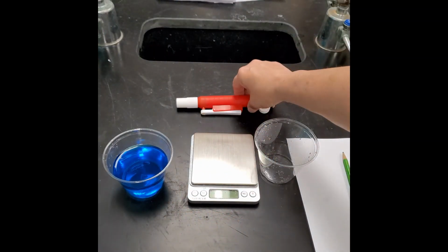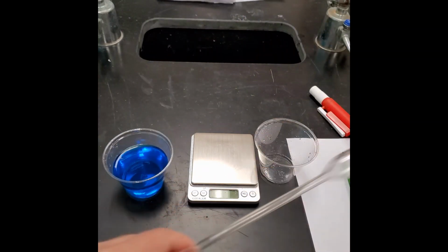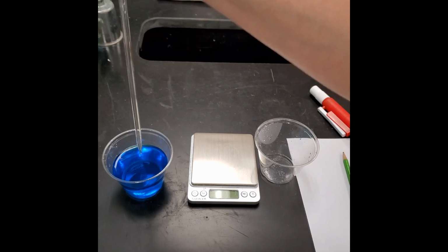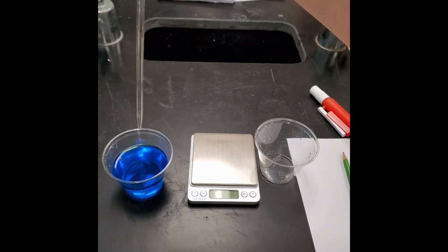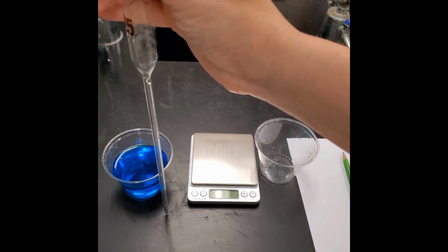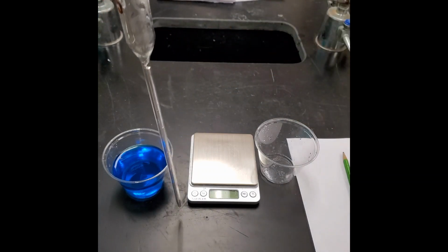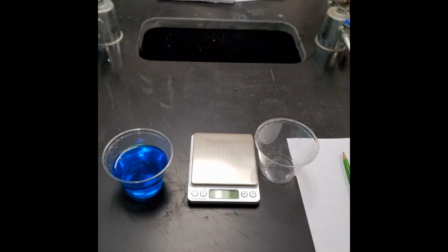Now, how you use this, first, you're going to be very careful of the tip end. You never take this and jam it down into your solution and push it down into the table. Okay, what I see kids do a lot is they push it onto the table. Do not do this. And then take the filler and put it on while it's pushed onto the table. You never do that, okay?